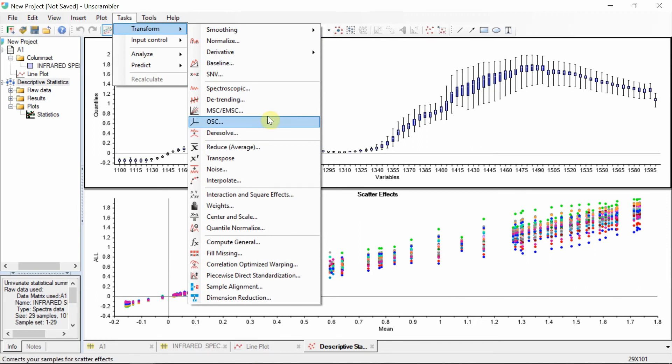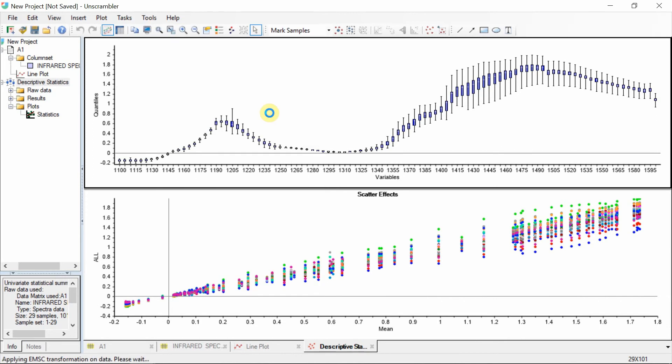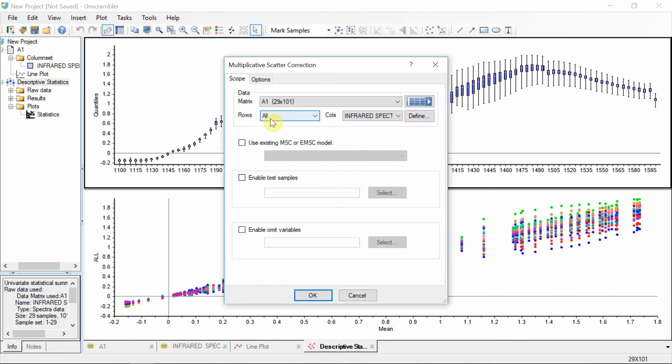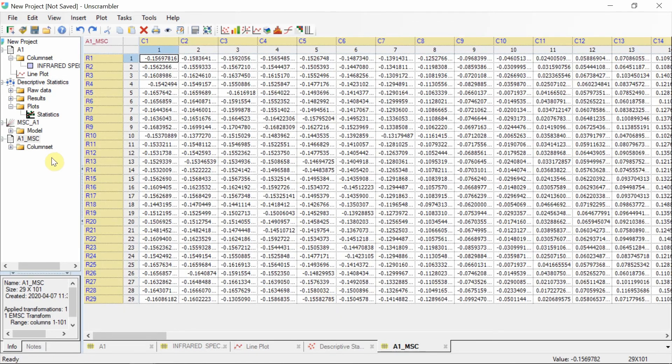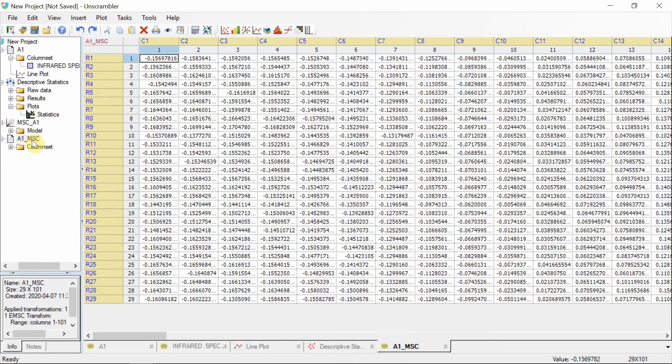We can apply, for example, a multiplicative scatter correction. Define the spectral data you want to transform here. A new node appears in the project navigator with the transformed spectra.